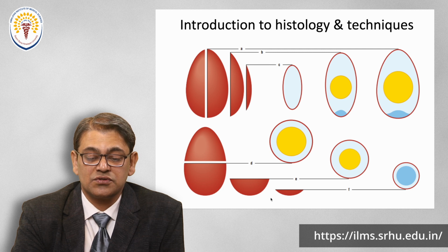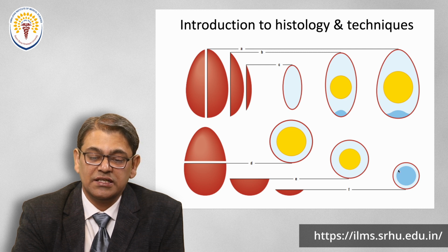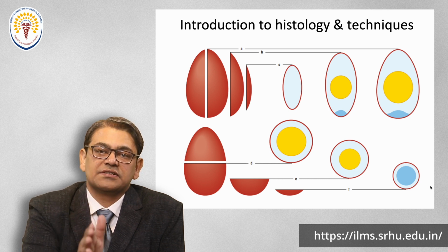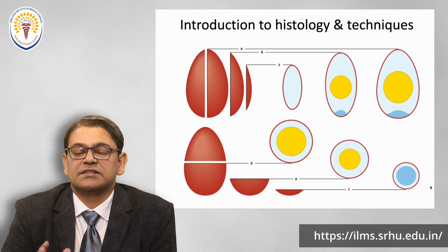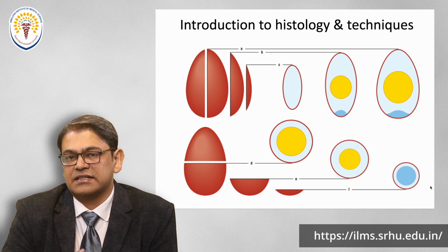And if you go close to the poles, you see an almost reduced periphery, and the yellow is gone, and a blue colored structure which is present somewhere in this bottom area is now clearly visible. So these are the two sections, one is coronal, another is horizontal, and with these two sections we may create a 3D structure in our mind of how exactly the cells are arranged.